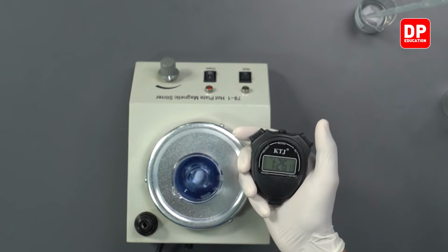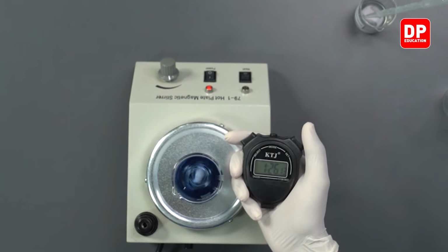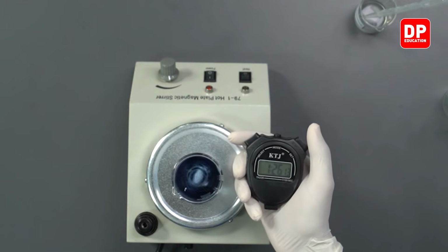Color change was given at 1 minute 26 seconds.